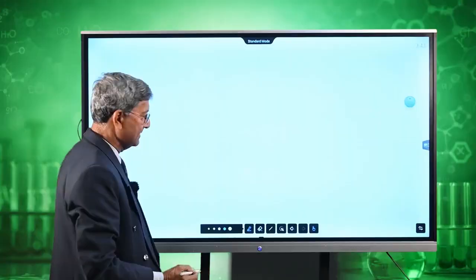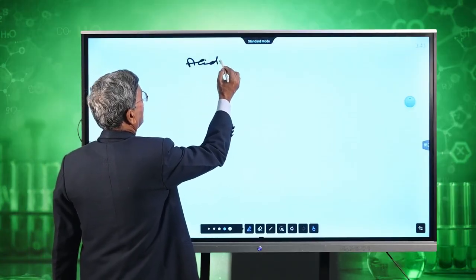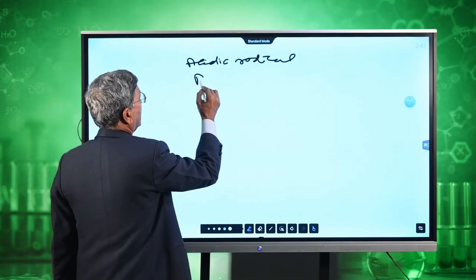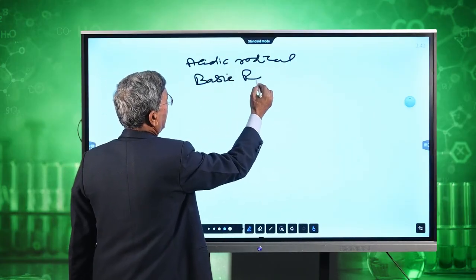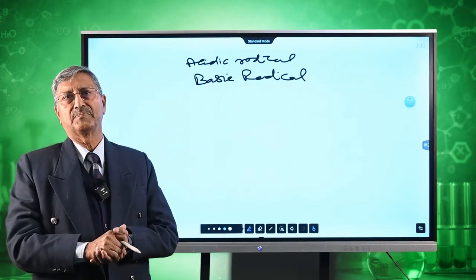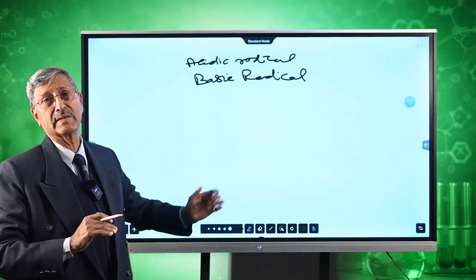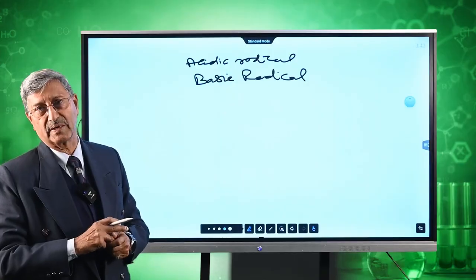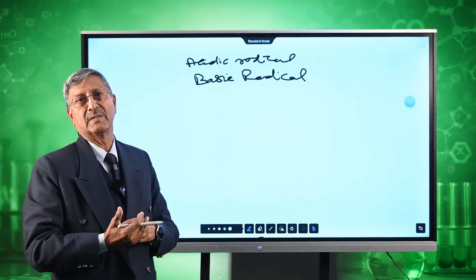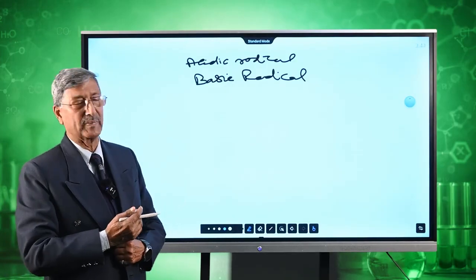Thank you very much. As I just said, we have acid or acidic radicals and basic radicals. We have a systematic plan which is known as the scheme of salt analysis, with the help of which we analyze acidic radicals and basic radicals separately. So first of all, I'll take up the steps which we take for the analysis of acidic radicals in a given mixture.